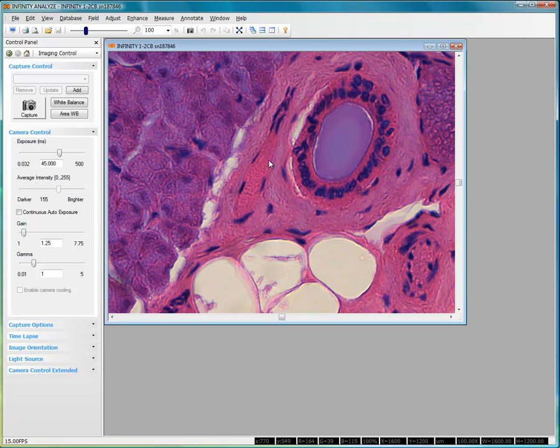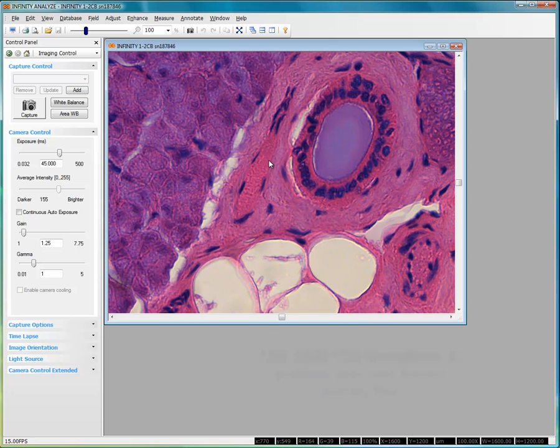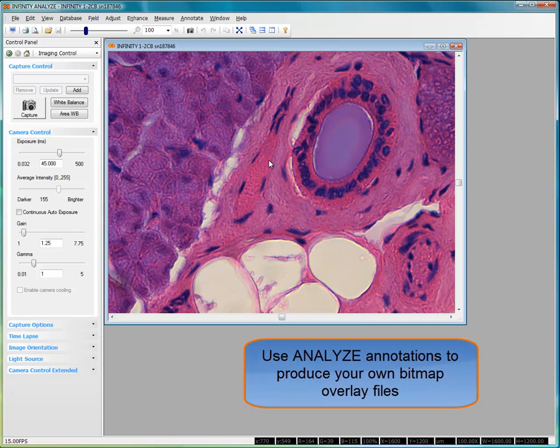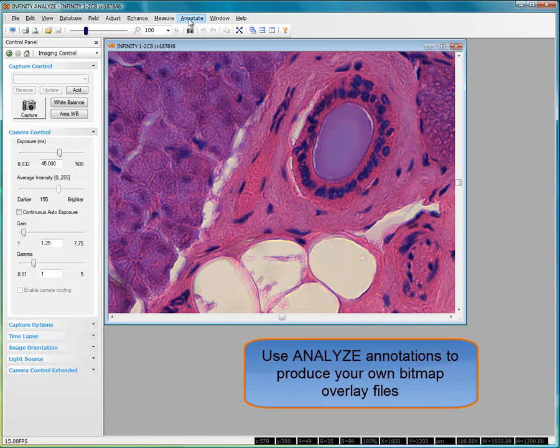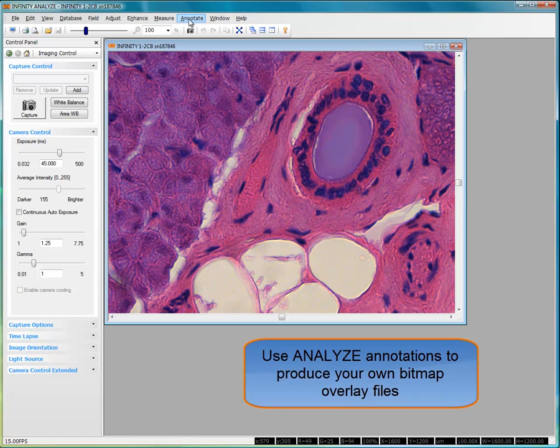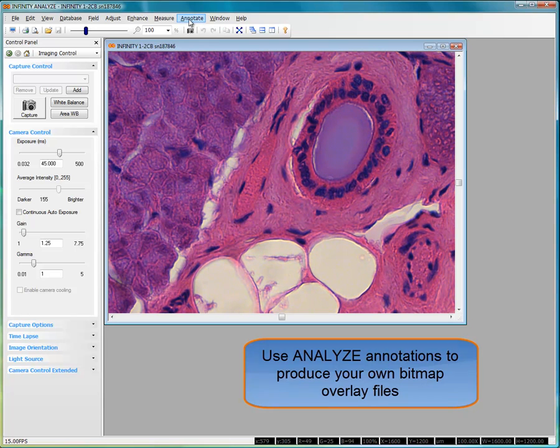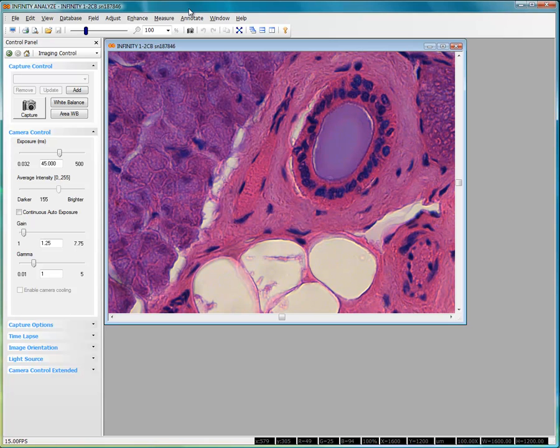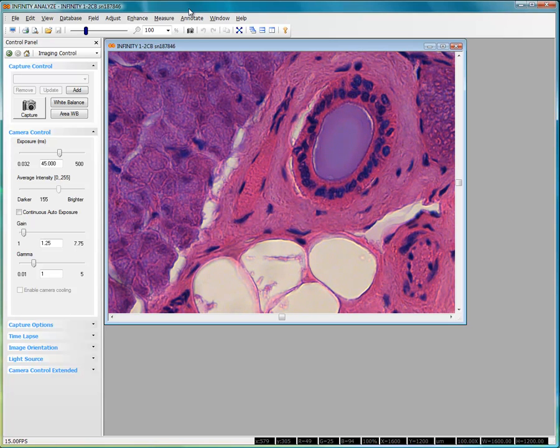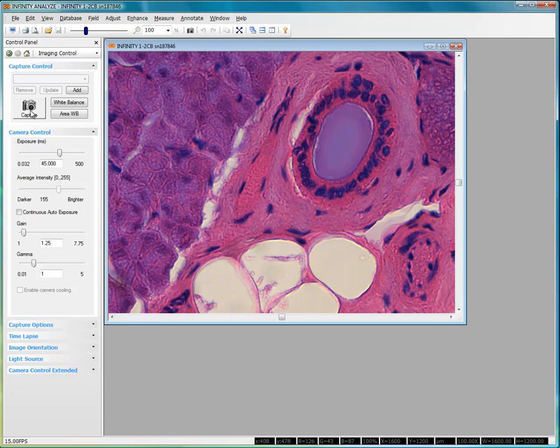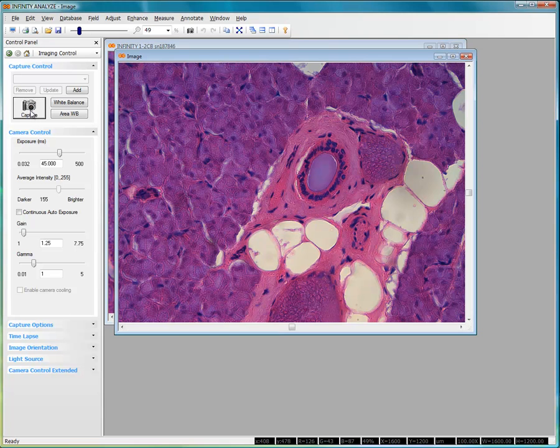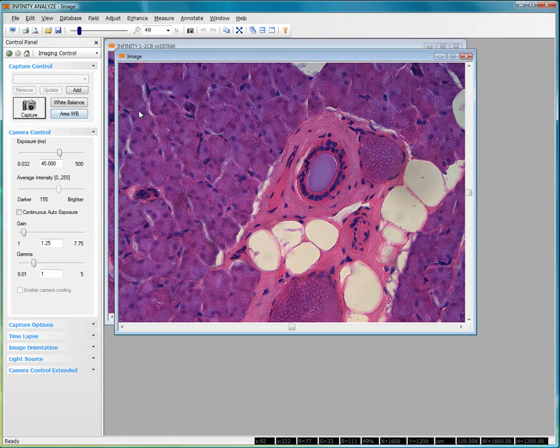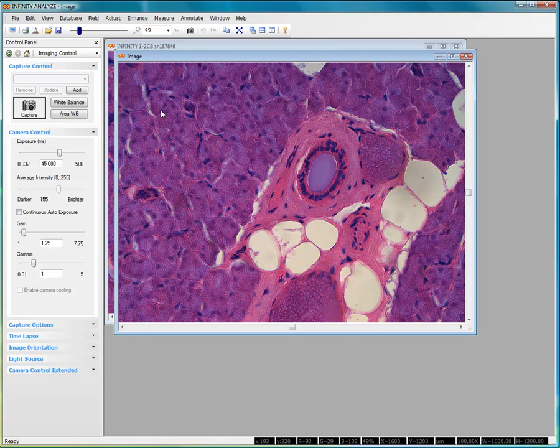With the release of Infinity Analyze 6.0, an option was introduced to be able to generate bitmap overlay files using the annotation capabilities within the program. To create your own bitmap overlay, start by capturing an image. The next step is to create the desired annotation overlay on this image using the operations available in the annotation drop down menu. In this example, we'll place some text.